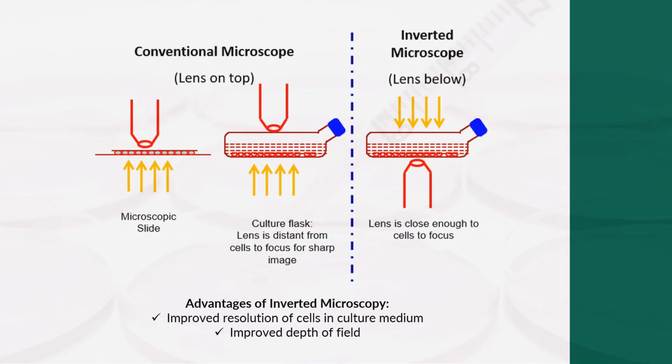They allow easy access to the culture vessels. The objective lens can be positioned very close to the cells, enabling high resolution imaging. And it also minimizes the need for long working distance objectives. So it's really a very useful piece of equipment.